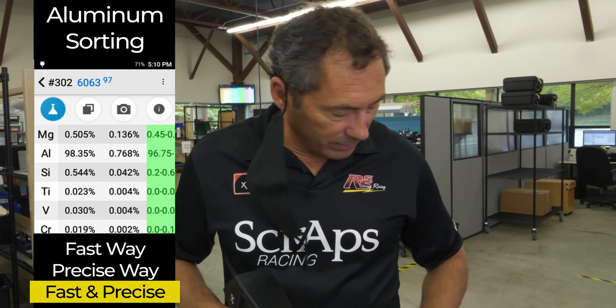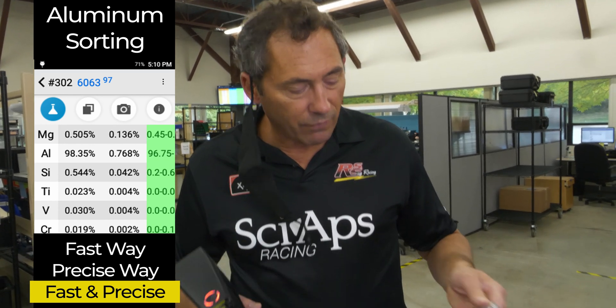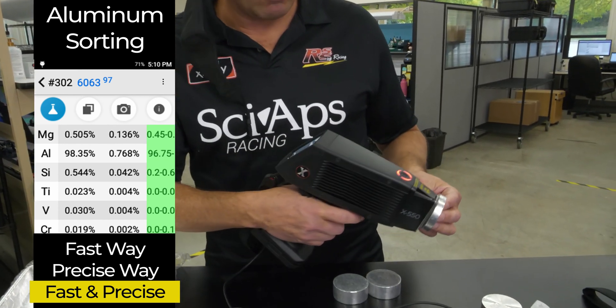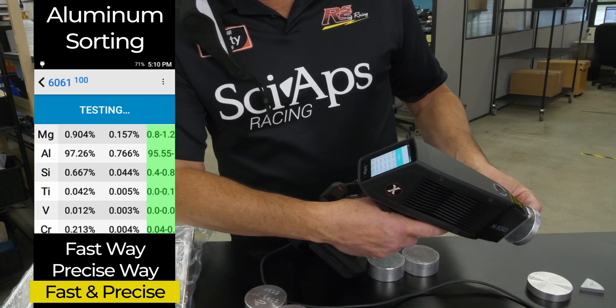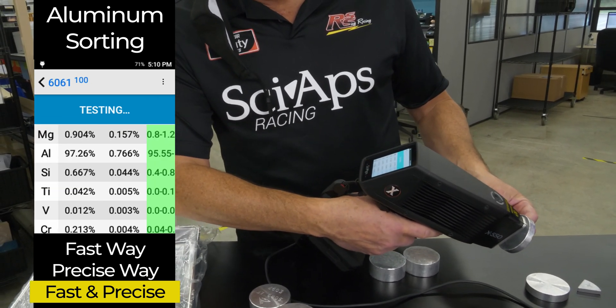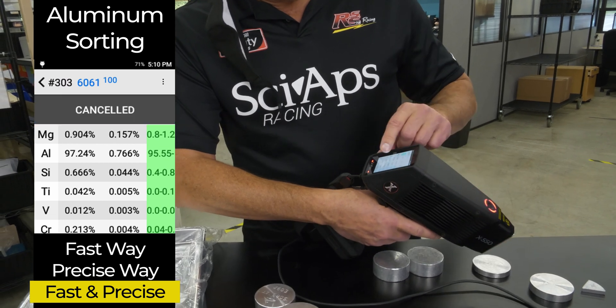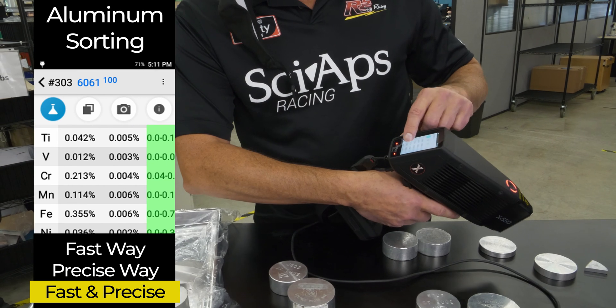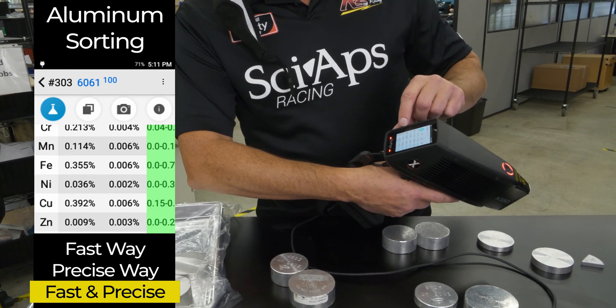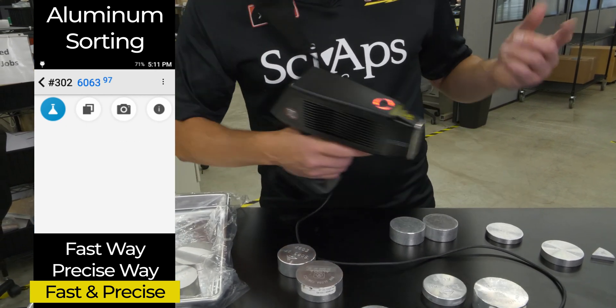It does all the aluminums; I just like to start with that one. Just to give you an example of how fast this thing measures low magnesium — here's your 6061. In less than a second, it's saying 1% mag, and there's your 6061. You get your typical elements of 6061: your low chrome, your 0.3% or so copper, all in spec. There's your 6061.